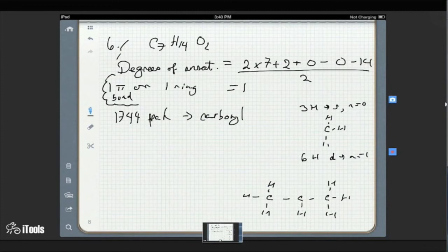So it just says that ketones, aldehydes, acids, esters are higher, about 1735. So it's not an aldehyde, and it's not an acid, so it has to be a ketone or an ester. Or one of the oxygens. So let's draw a ketone to start. Well, since we have another oxygen, let's pretend it's an ester. Alright, let's do that.